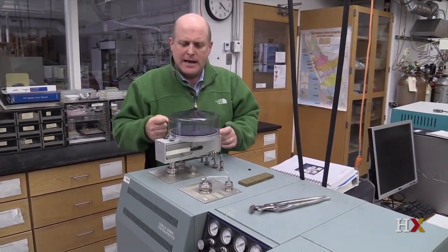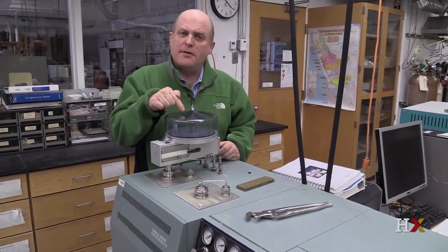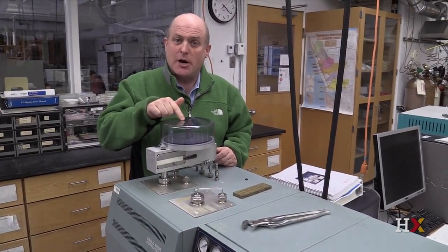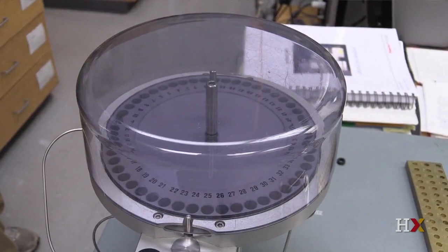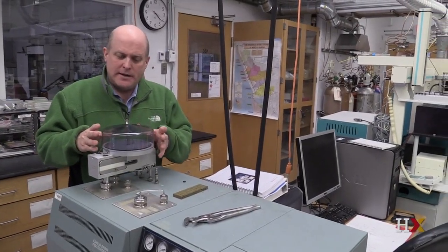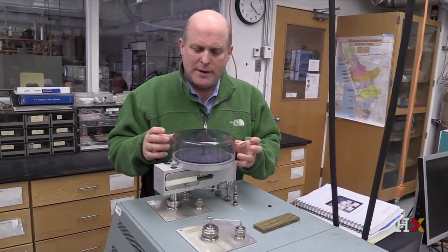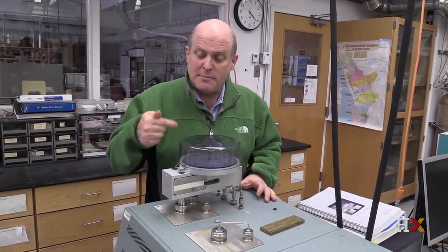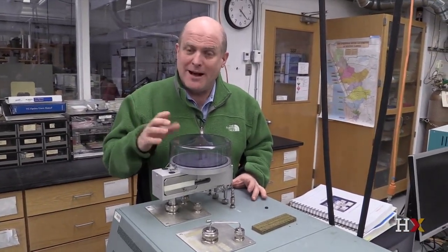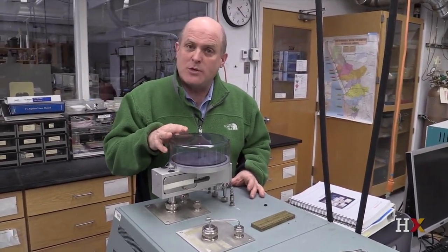It gets very hot and introduces the sample to a stream of oxygen. The oxygen combusts the sample and turns organic carbon into carbon dioxide, which is then flushed into the mass spectrometer and ultimately measured. We can actually use this instrument not just for organic carbon, but for measuring organic nitrogen as well. So we can measure the ratio of nitrogen 15 to nitrogen 14 in the nitrogen that's part of organic molecules, like amino acids. But we use this very commonly for measuring the C13 to C12 ratio in organic carbon.